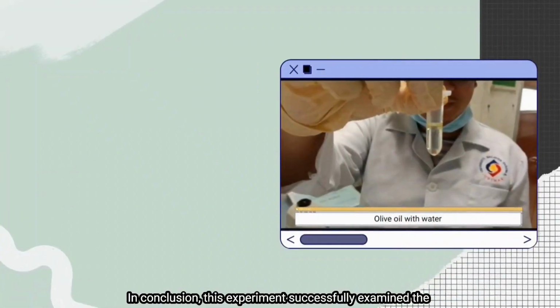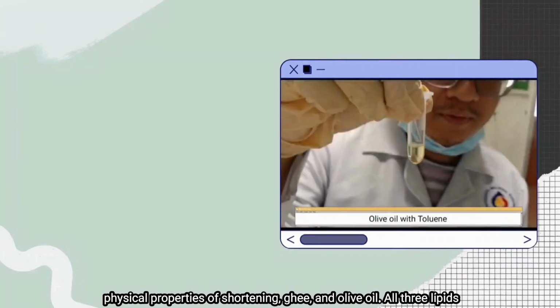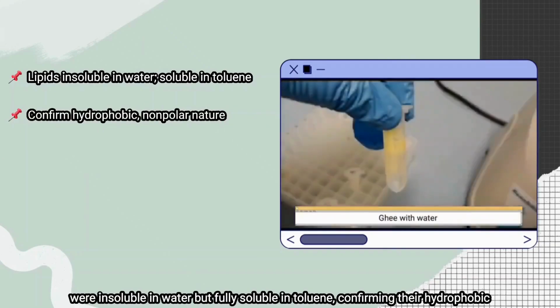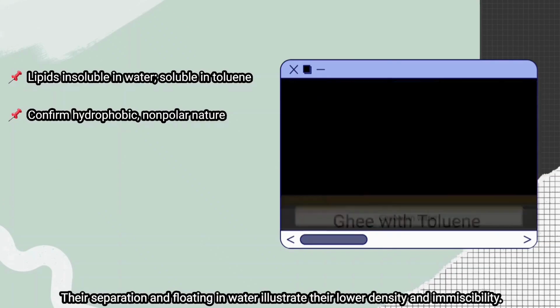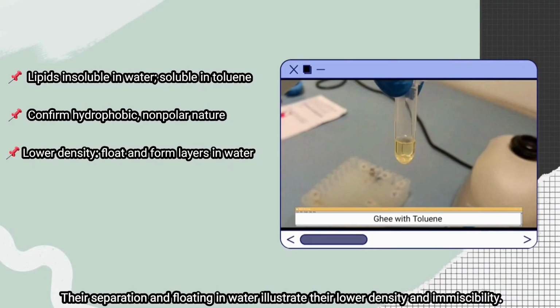In conclusion, this experiment successfully examined the physical properties of shortening, ghee, and olive oil. All three lipids were insoluble in water but fully soluble in toluene, confirming their hydrophobic nature and the principle that non-polar solvents dissolve non-polar substances. Their separation and floating in water illustrate their lower density and immiscibility.